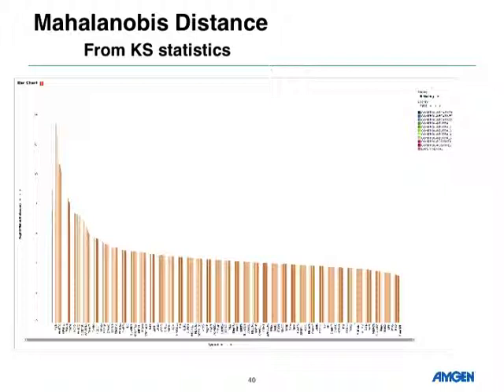If you put that data into a grouping, from things that are very different from my controls to things that are very similar, this gives you an ability to validate whether your controls are working, and to lump these together.